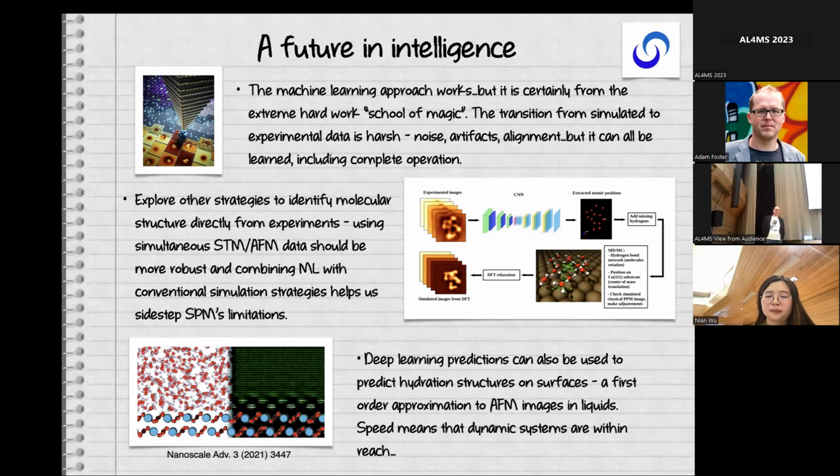Thank you, Adam, for the very interesting results. I had a question on the ice flakes or the ice clusters. They're really tiny, right? So they're not yet very regular ice structures. When you said your plan was, or you may be already doing it, to image in real time and have this real time identification, is your recognition model continuous? If the cluster evolves in real time, does your prediction continuously evolve too, or do you get some artifacts?